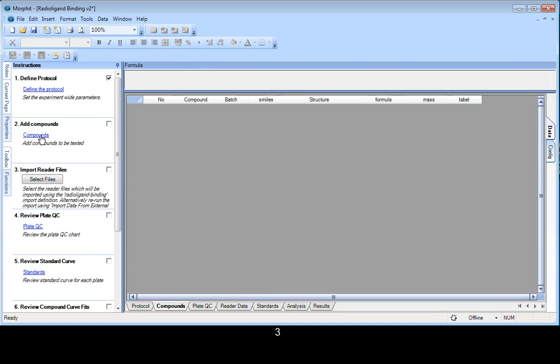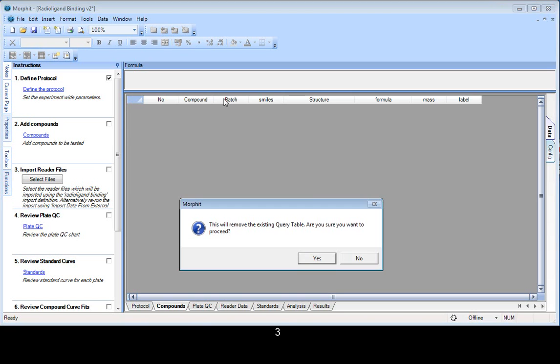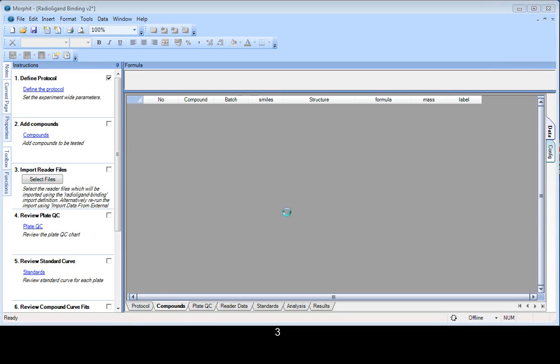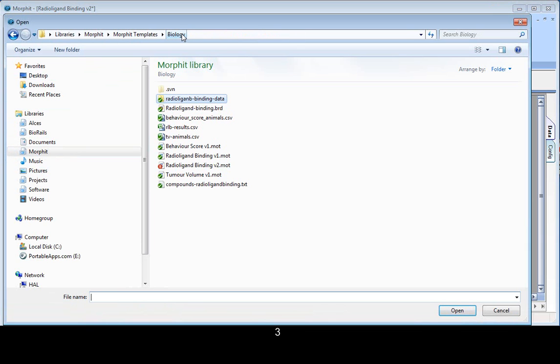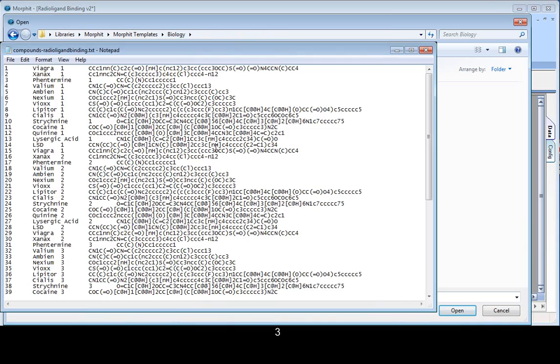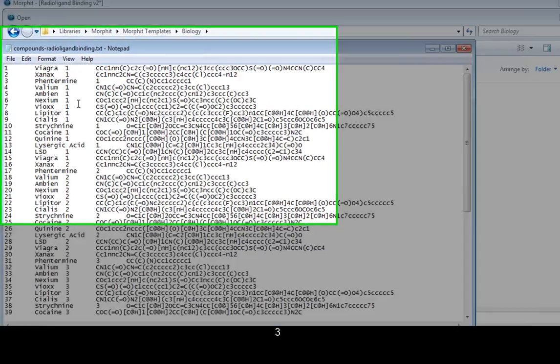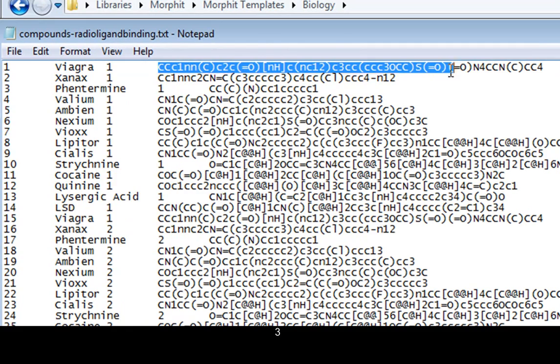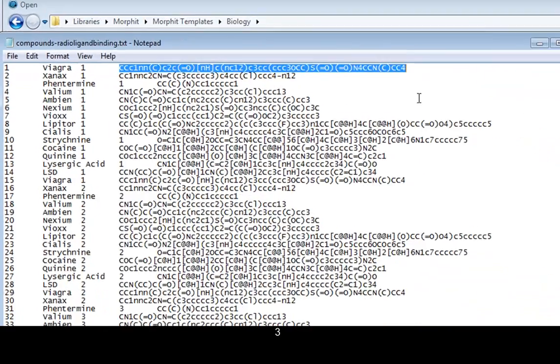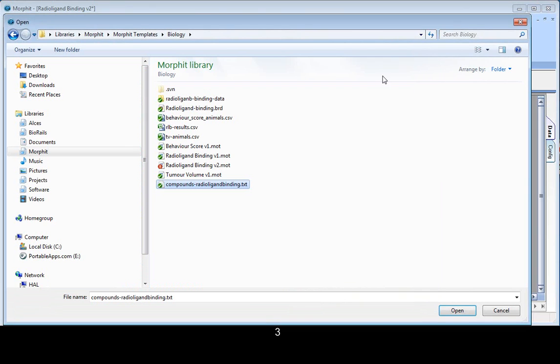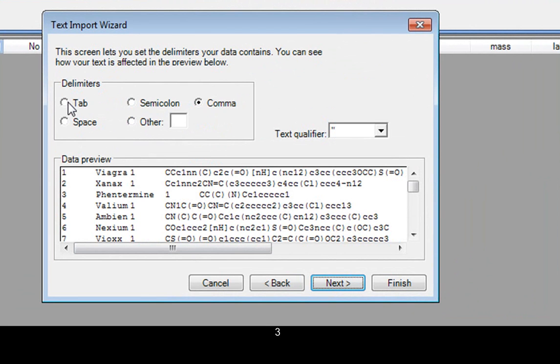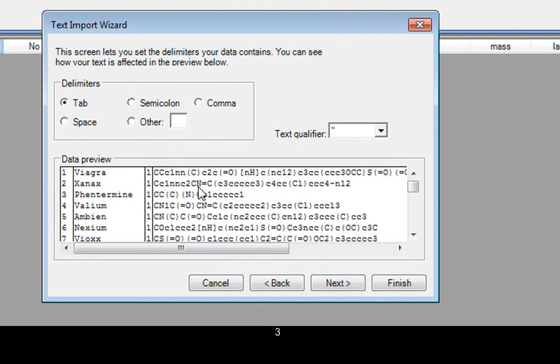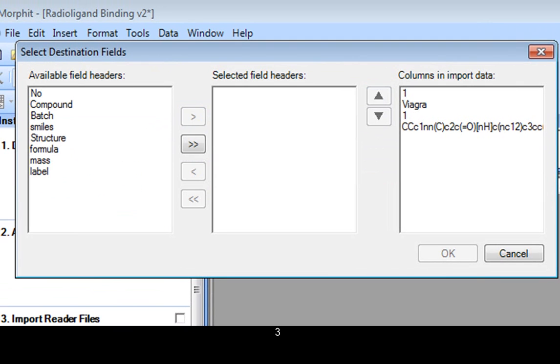The second step is to import our list of compounds. Now, we could create a number of rows within this table and then paste in our compounds from things like Excel. But in this case, I've got the compound list in a data file, in a text file. So let's have a quick look at this. So you can see in this case we've got a compound number, the compound name, and its batch. And we've also got some SMILES information, so we can bring in the structural information with the data. So I'll run the standard data import routine. I'm going to accept all these columns, finished.